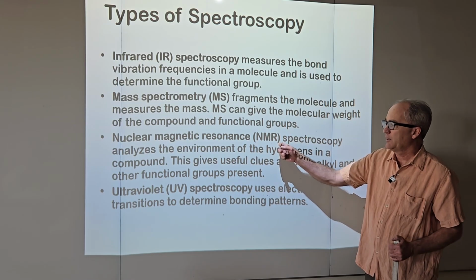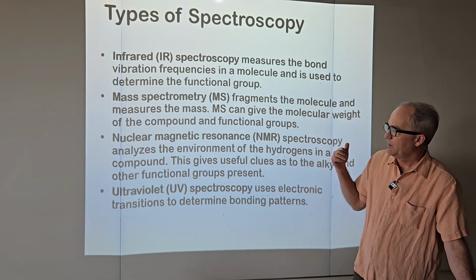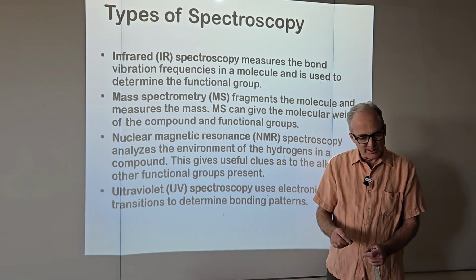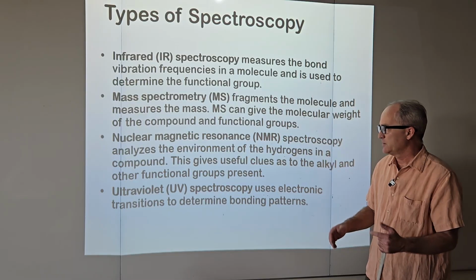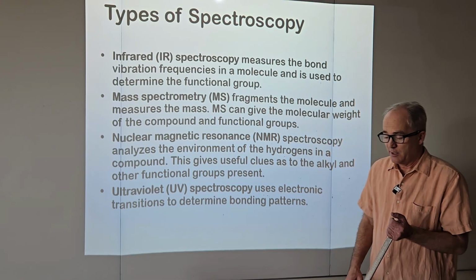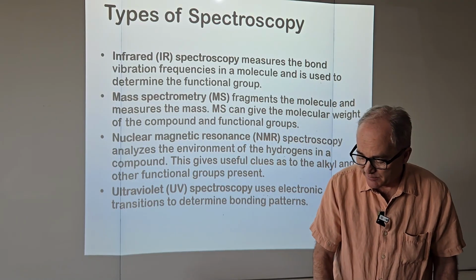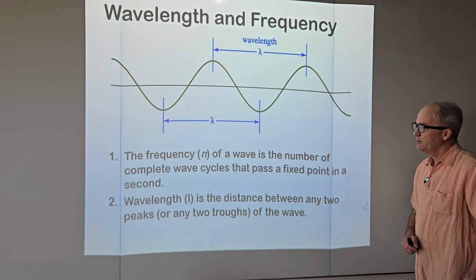So we now have a little 60 megahertz NMR spectrometer over in the balance room. You stick a little glass tube inside a magnet, and there's a radio transmitter and receiver, and it does the experiment. And we can see what frequencies change the spin state of the nuclei. I don't want to run too far ahead of myself on that.